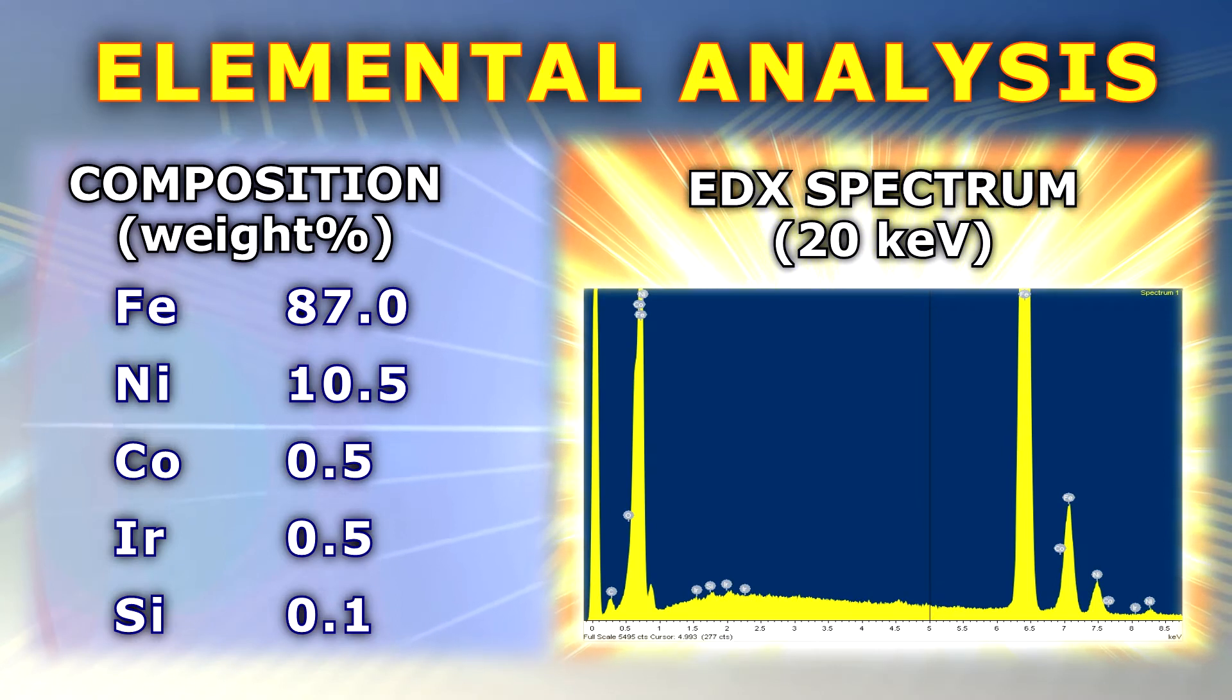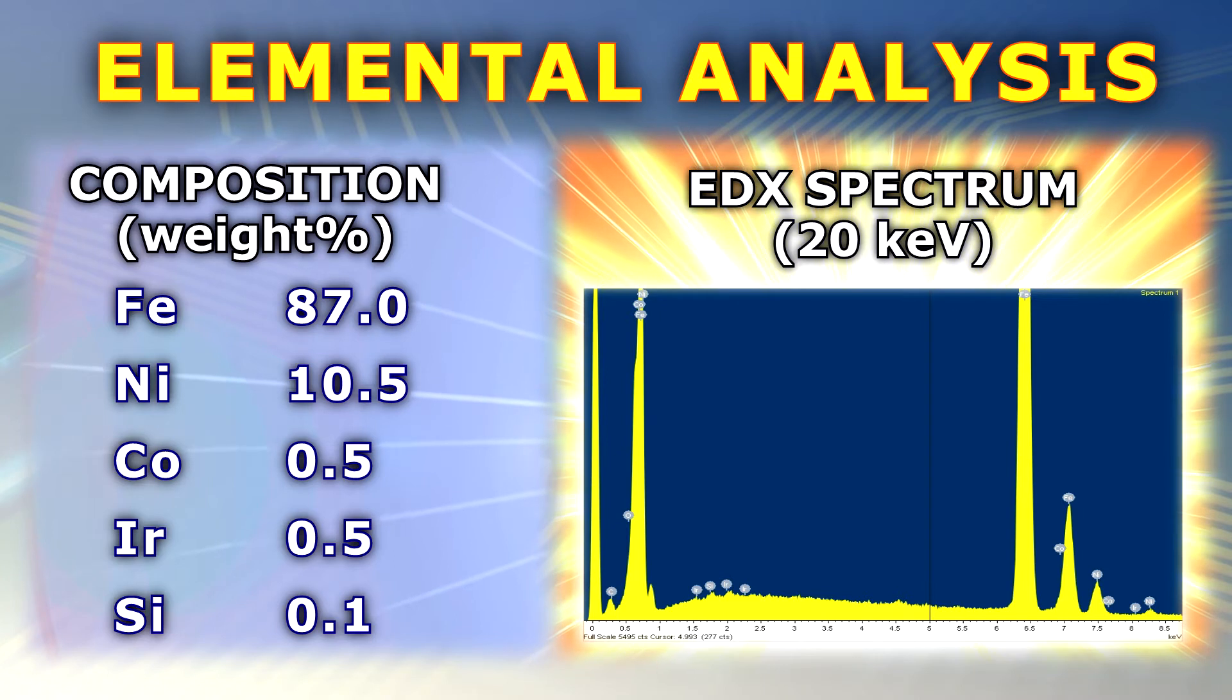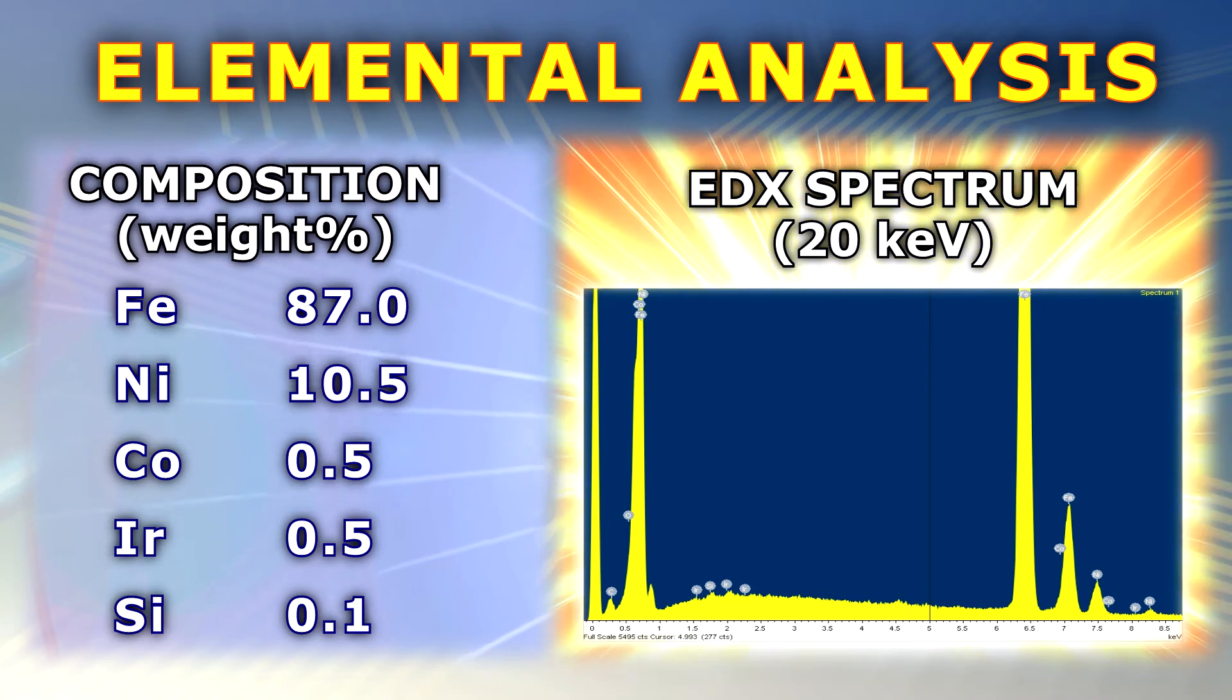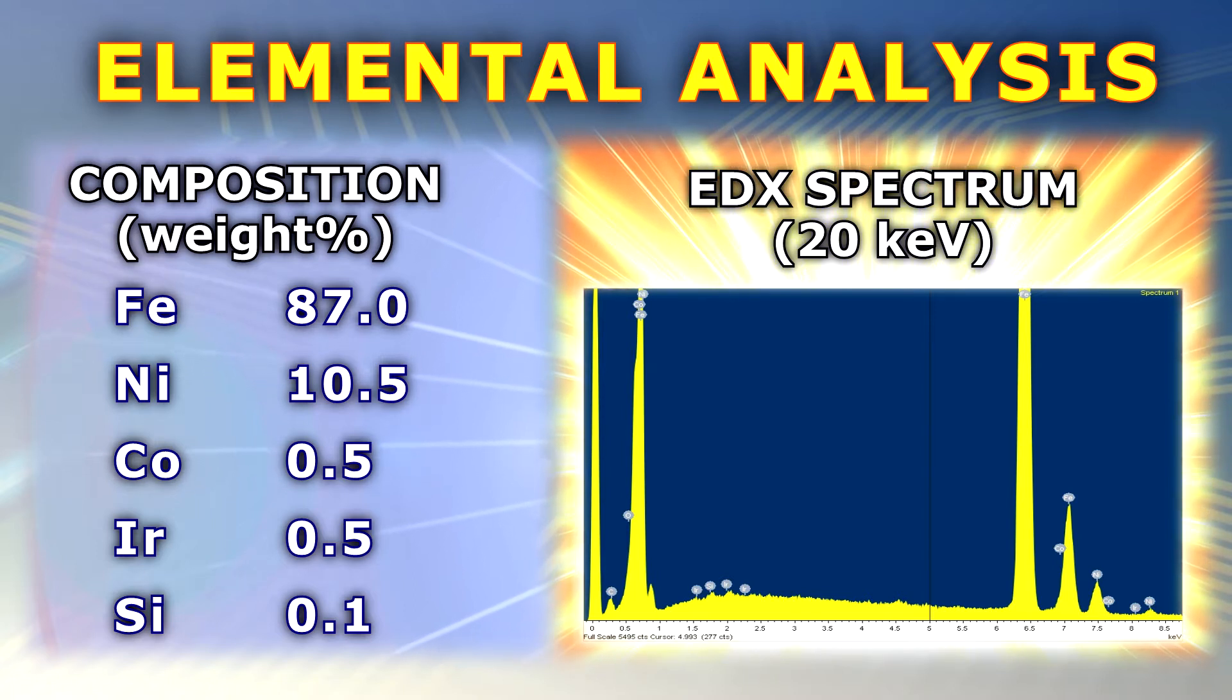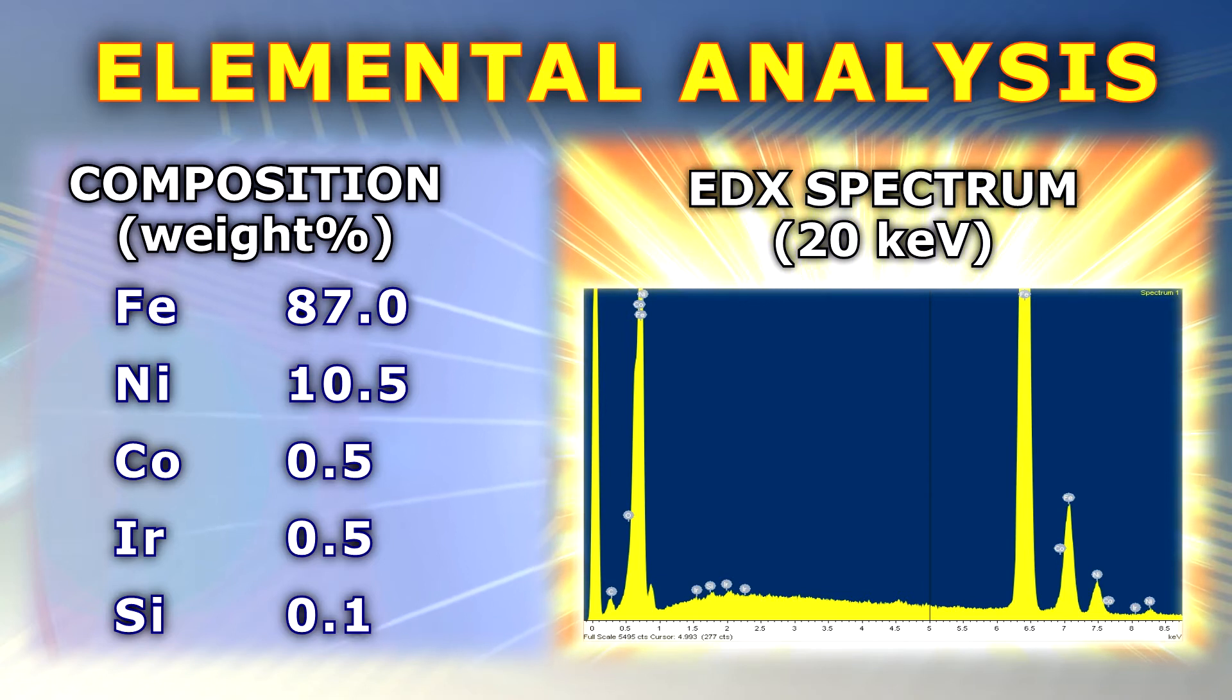As you can see, our current sample is metallic and consists mostly of iron and nickel, which means that it is a fairly common meteorite. To our big surprise, the analysis program also shows a small amount of iridium.